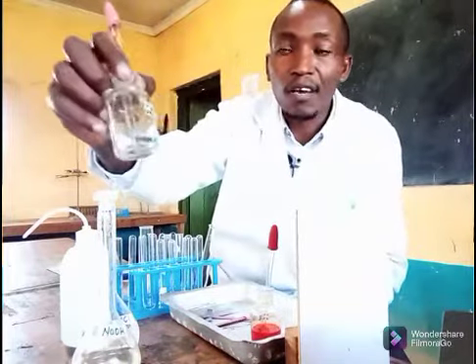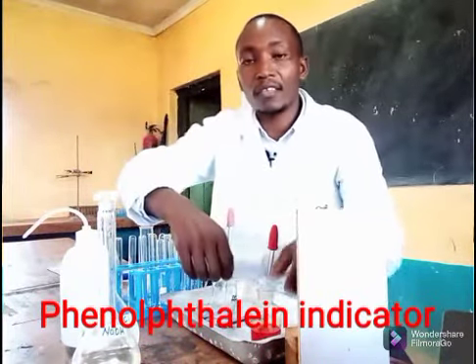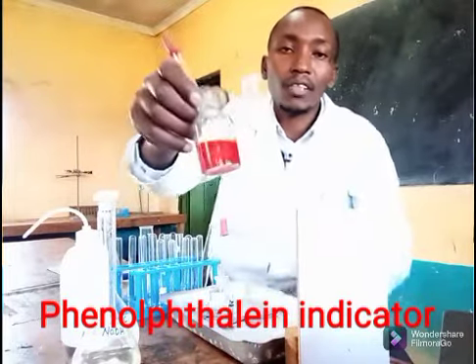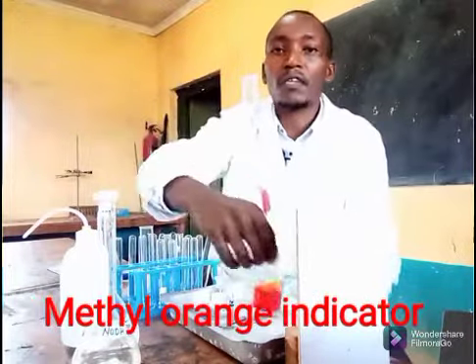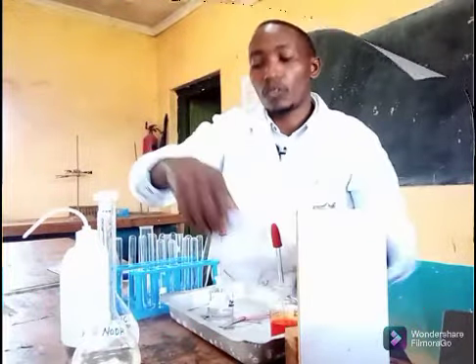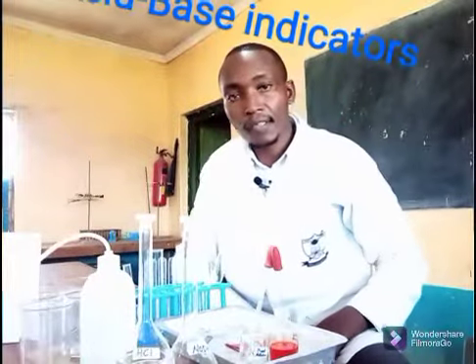I have another one here. This is phenolphthalein. Phenolphthalein is another indicator. And I'm going to use another one here called methyl orange. Okay, where do I start?